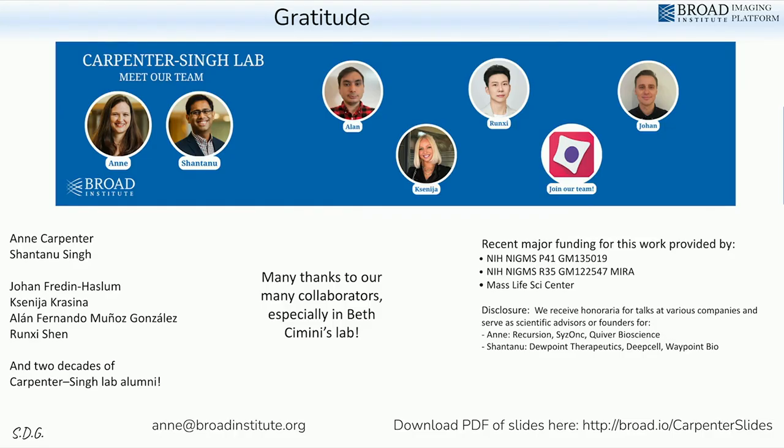Sometimes if you ask me or Beth Cimini, we've seen enough of these to say, oh, that sounds like a really complicated mess, but actually it's probably mitotic cells, or something like some of them we've seen before. But a lot of them you hit a wall. The good news is that the computer vision world is excited about this problem for all kinds of other reasons, selling ads and who knows what else.